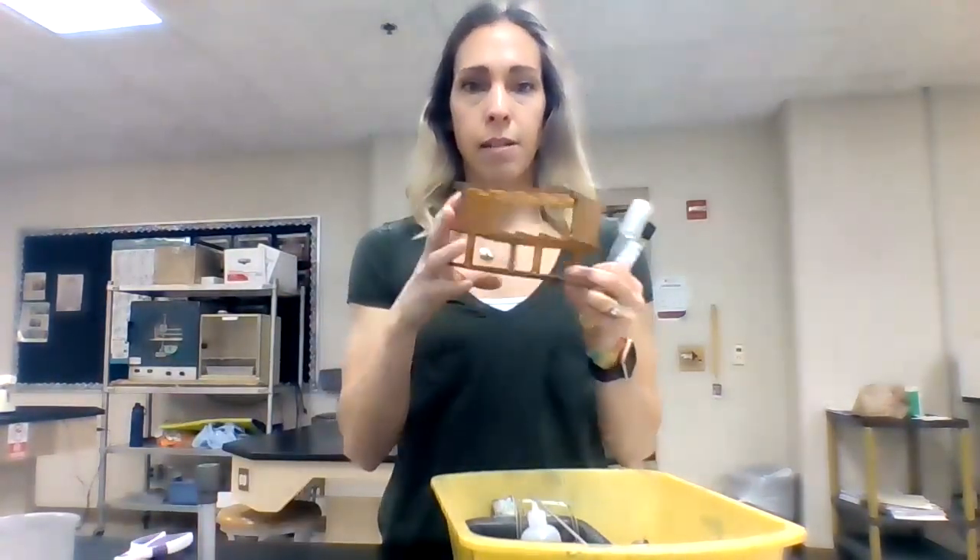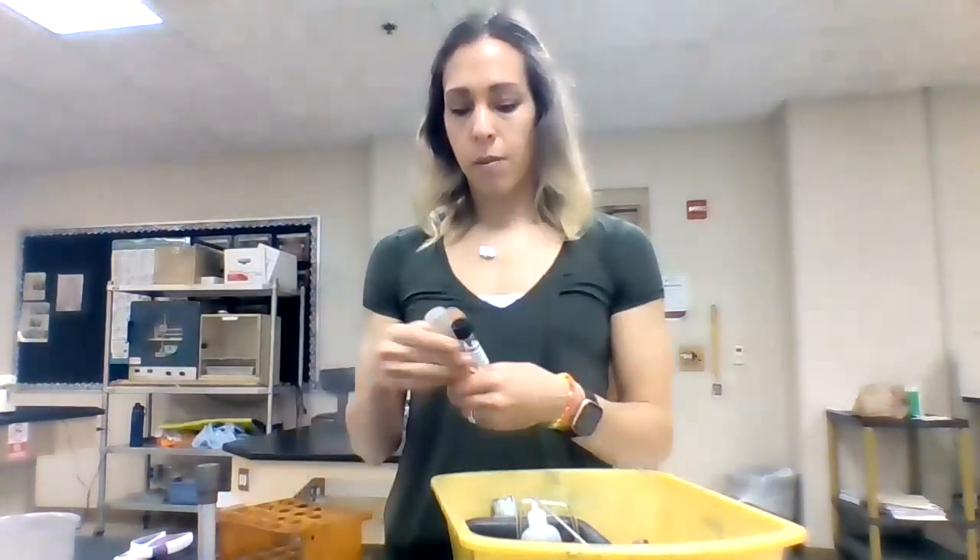We are going to need a test tube rack — plastic or metal, it doesn't matter — where we're going to keep our bacteria so it doesn't roll off the table.